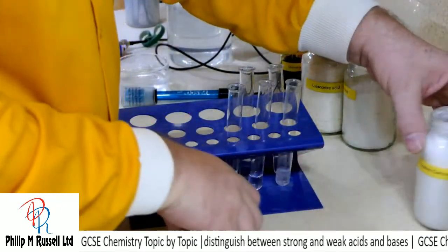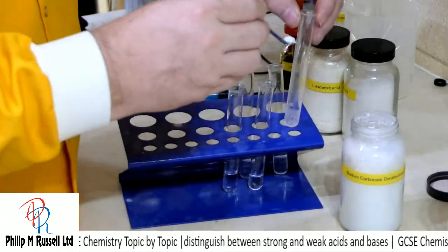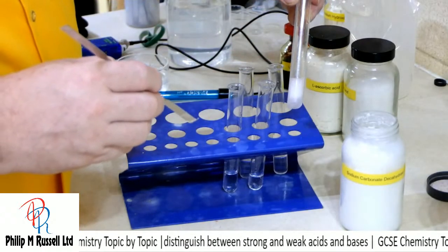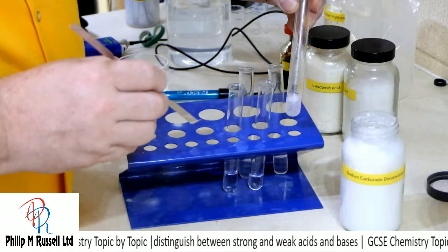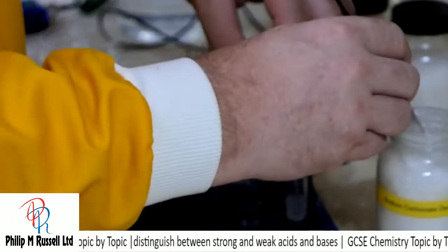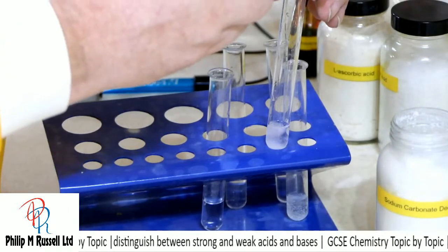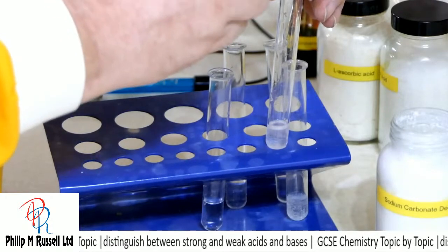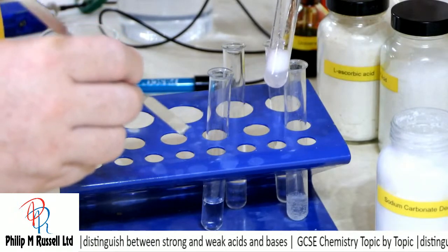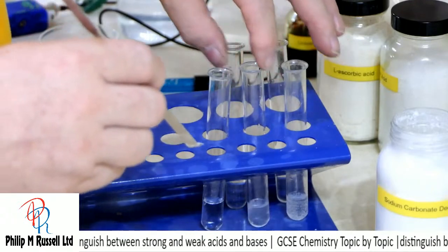Let's see what happens with a weak solution. So the strong again, to remind you. Slower than one of the other acids. 10 times as weak. And the reaction is not anything like as strong. Still working, but not as strong, not as fast.